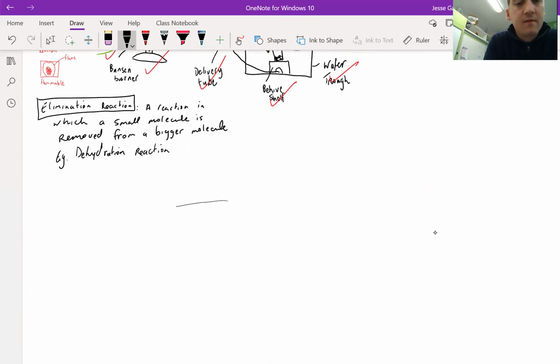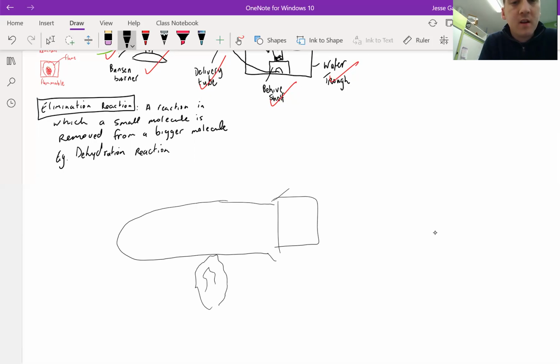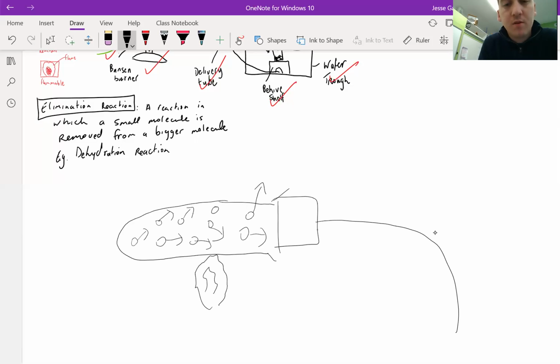Okay, so we've got our boiling tube, and when we are heating, we've got a flame here. When we are heating, what's happening is all the gas particles inside the tube here, we are increasing the pressure, which means they start to move more quickly in all directions. So the pressure in here, we say, increases. And when it increases, there's an escape route, and that's down the tube. So they will start to move down the tube. So heating increases the pressure.